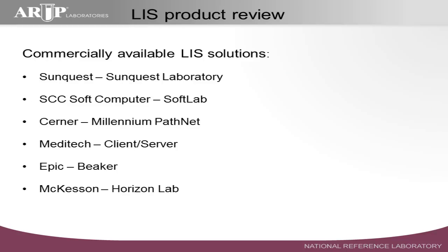Okay, for the product review, there are several commercially available lab information systems out there in the market. These are some of those. Probably I would consider these to be the most popular. So if you go into any hospital laboratory around the United States, you'll probably more often than not find one of these lab systems.